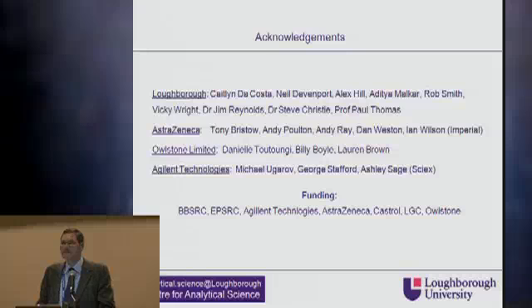Thanks, very good talk. Can we go back to this slide of the conformer separation? Yes. Alex is going to elucidate this in much more detail in a moment, I think. But this particular species, the doubly charged species, from other studies using drift tube and other techniques, is known not to be a single conformer.